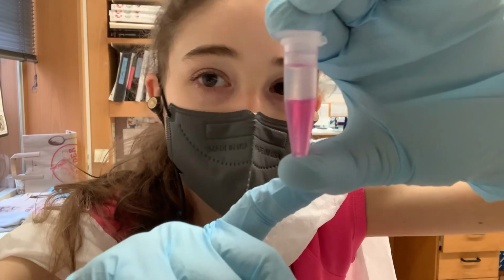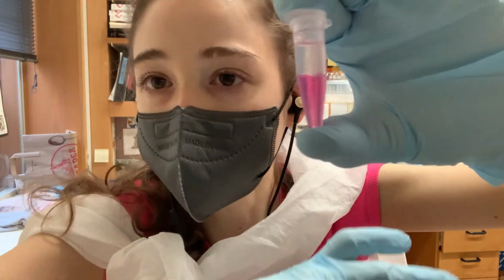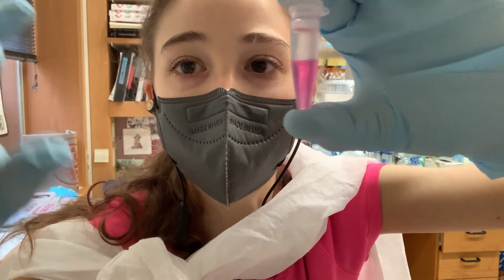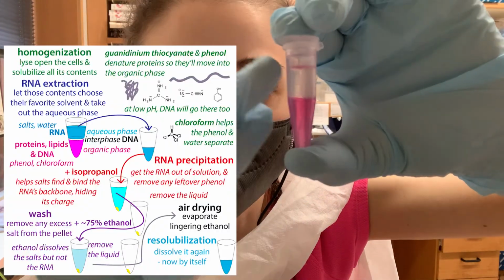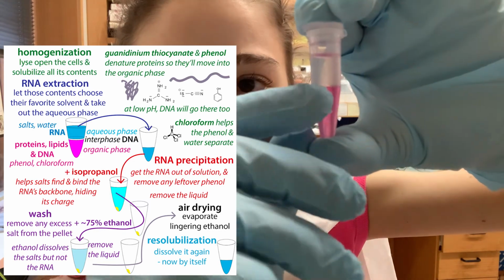And with this extraction method, it's a liquid-liquid extraction. Taking a solution with all sorts of stuff, proteins, lipids, DNA, RNA, we're going to make it so that only the RNA wants to hang out in this phase. And everything else is going to want to hang out down here or in this middle.